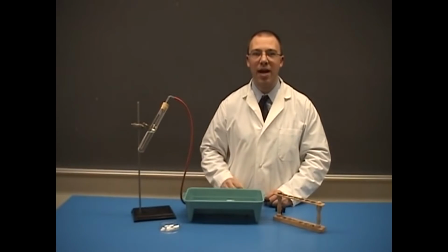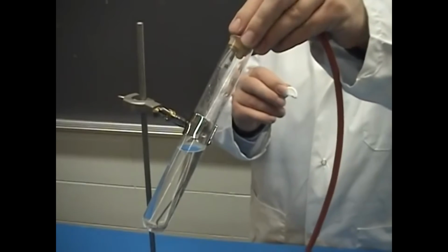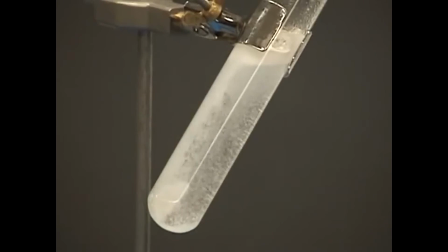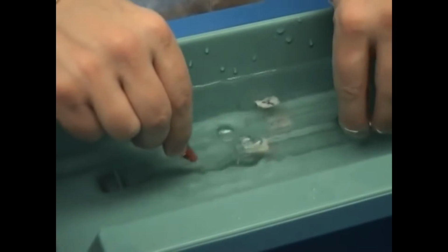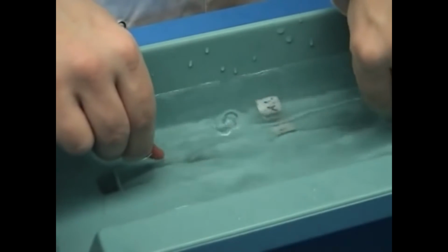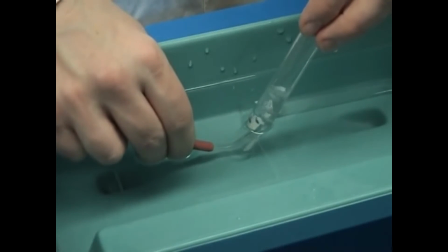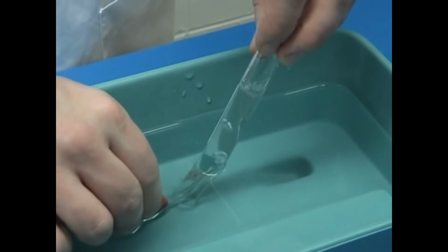Place half an Alka-Seltzer tablet in the test tube. Place the rubber stopper in place securely and submerge the glass elbow under the water. If the reaction ends prematurely, you can add half an Alka-Seltzer tablet to continue the reaction in order to collect the rest of the gas.